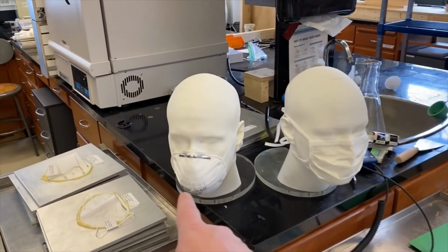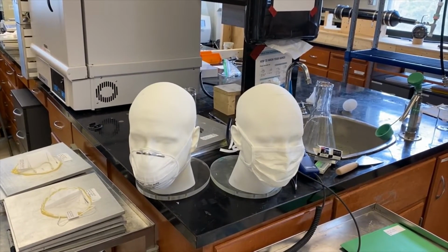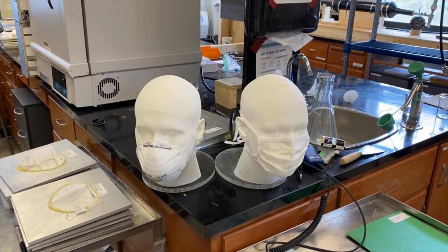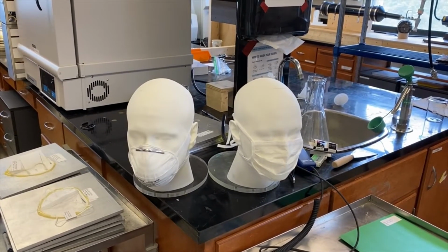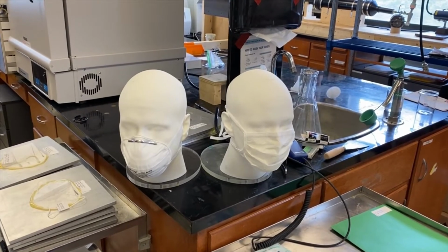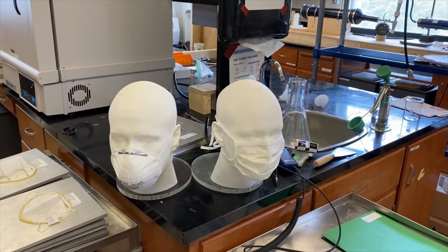In order to test respirators, we use a test method called the NIOSH test method, an acronym that stands for the National Institute for Occupational Safety and Health in the United States. That testing protocol is also recognized in Canada, although we've been cooperating with the Canadian Standards Association to try to write a Canadian standard that will replace it. Eventually, though, I expect that what emerges as a Canadian standard will look an awful lot like the NIOSH standard. Similarly, the Chinese standard, GB 2626, that's used to test KN95 masks, is also a lot like the N95 standard. In fact, it may actually be a little bit better than the N95 standard.